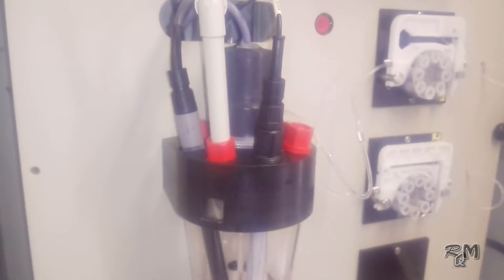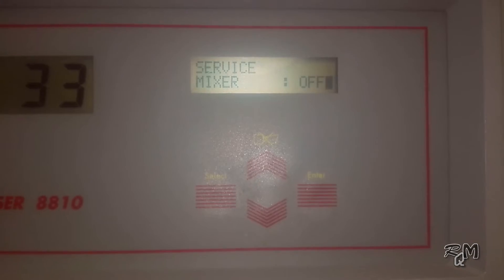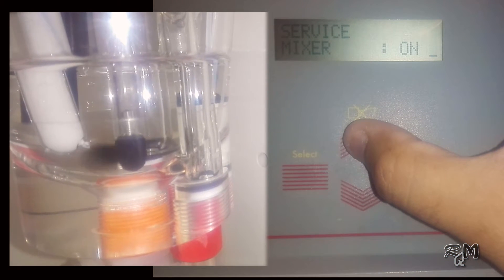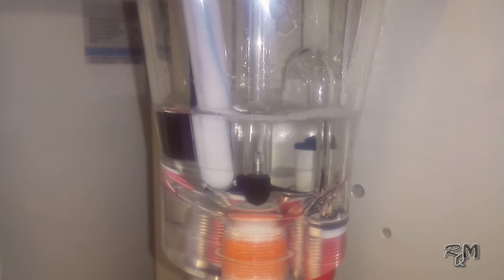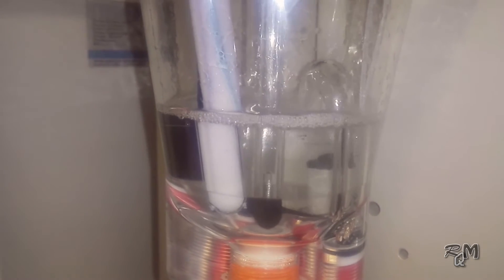After adjustment, tighten the threaded sleeve or hold fitting properly. Press Enter for the sprinkler menu — switch on the sprinkler and observe that it rinses both electrodes properly. The sprinkler should be installed in the middle of both electrodes. Then move to the next menu related to the mixer. Switch on the mixer and observe it should not rub with both electrodes, and the shaft of the mixer should not rub with the siphon tube. Press Enter to go to the cleaning menu — this is related to the cleaning pump installed on the back side of the panel. Switch on the cleaning pump; you will hear some noise — don't worry, this is the normal operating sound of the cleaning pump. After verification, switch off the cleaning pump.